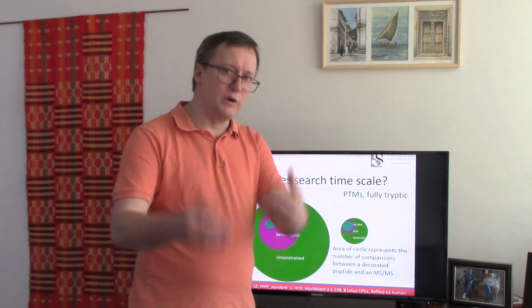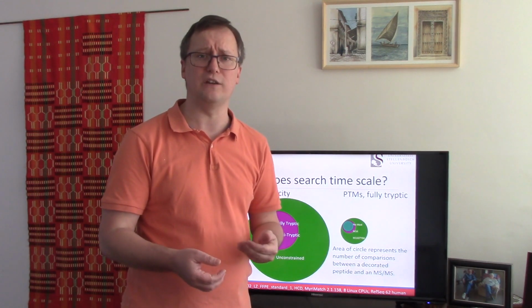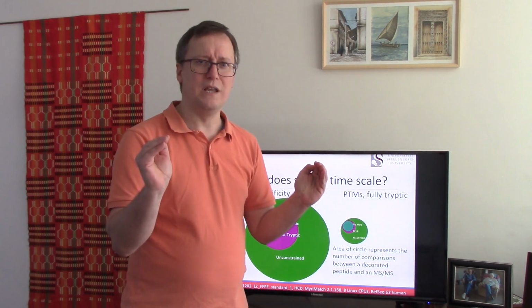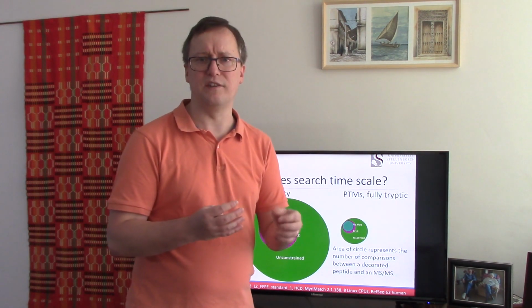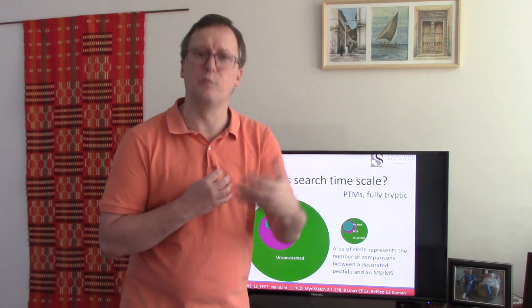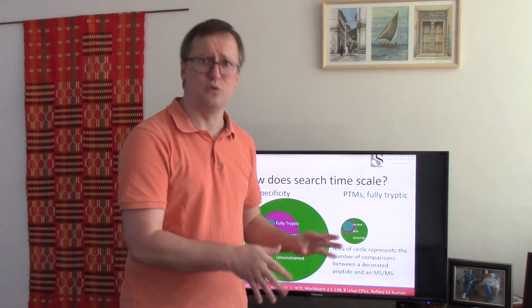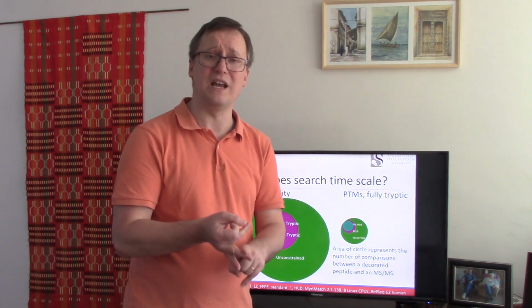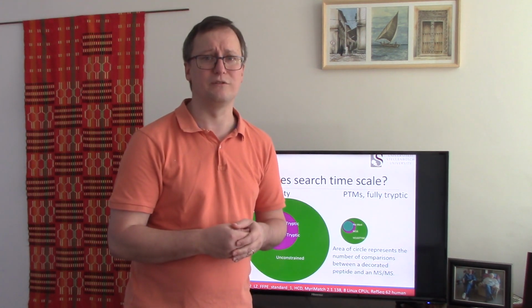So anytime you create a new configuration to search for post-translational modifications, you always want to think about how big am I making my circle? If I start considering 4 different mass shifts all within the scope of one database search, the circle that you produce is going to be massive and it's going to have a huge consequence in search time and in discrimination. And it's also going to have this problem of biasing towards peptides that contain modifiable residues.